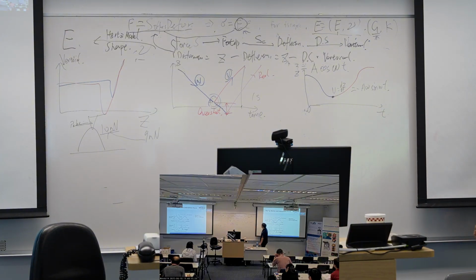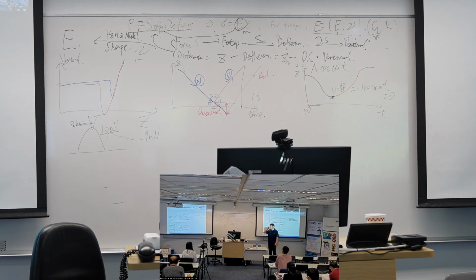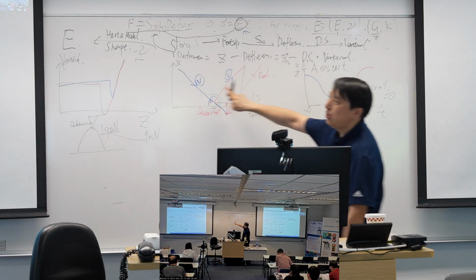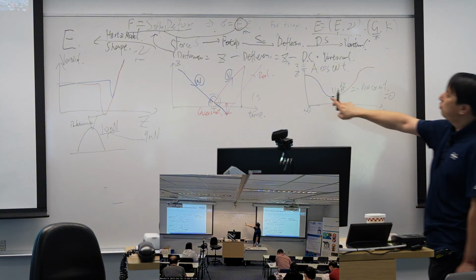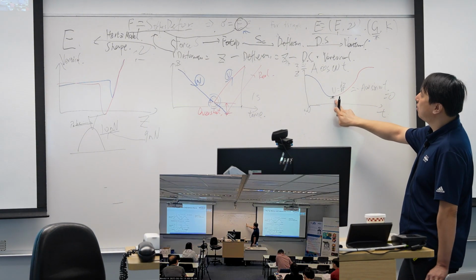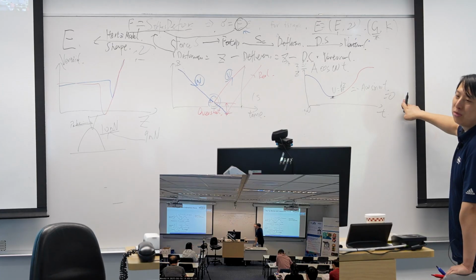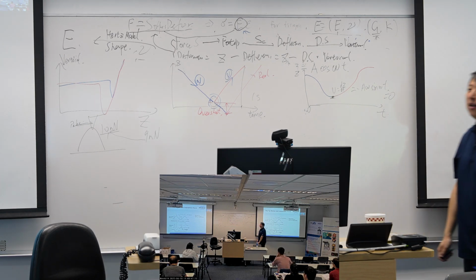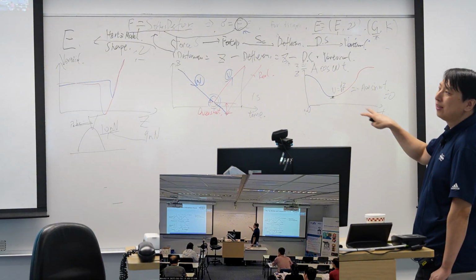So at this point, it will reach 0. That's the whole idea of my setup. Instead of the constant velocity, we change it into this sinusoidal movement. As such, when the probe touches the surface, its velocity dropped to 0. As the velocity dropped to 0, there will not be such overshoot on the sample. So I can control my force quite accurately.